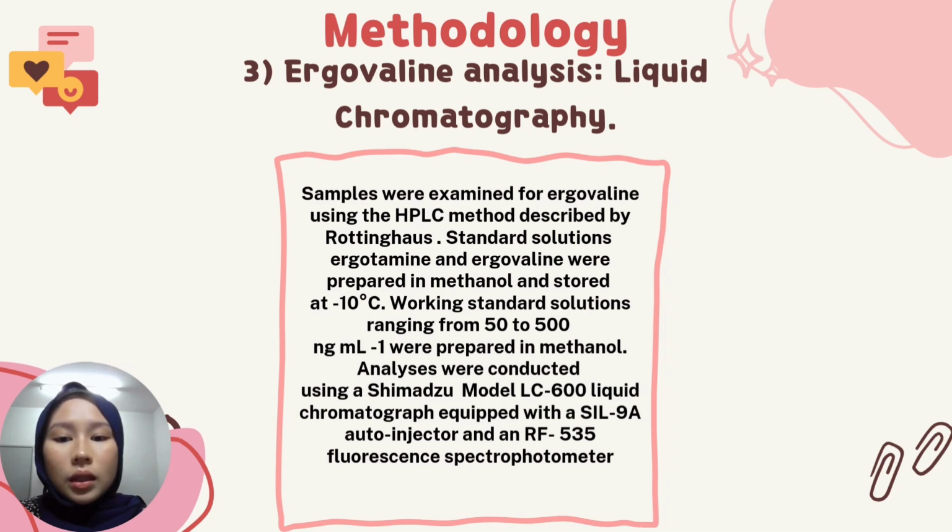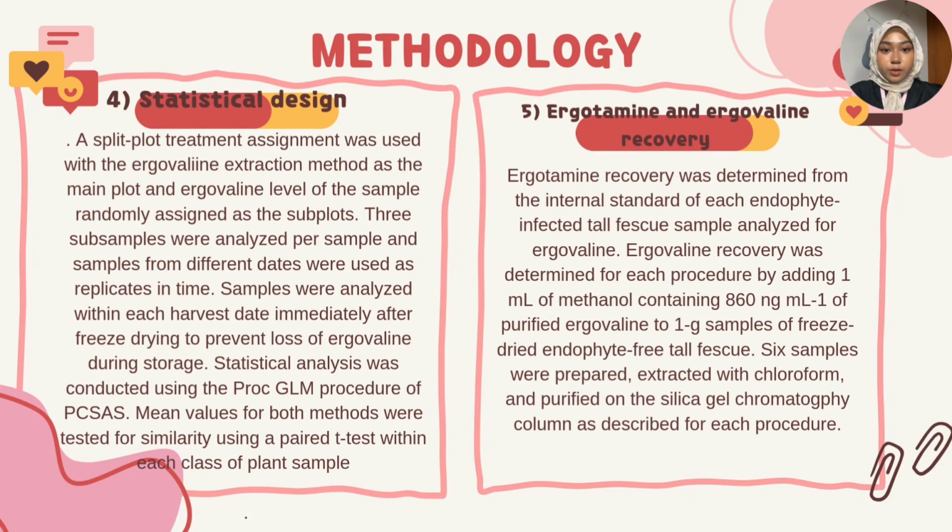Analyses were conducted using a Shimadzu model LC600 liquid chromatograph equipped with a SIL9A auto-injector and an RF535 fluorescence spectrophotometer.